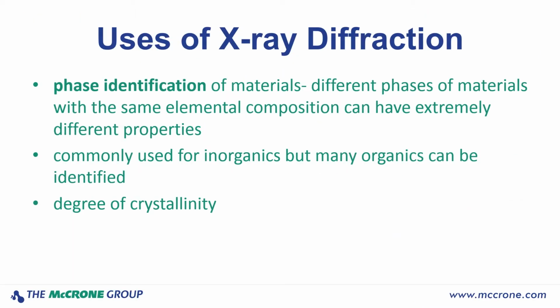Phase identification of materials. Simply explained, different phases of materials with the same elemental composition can have extremely different properties. X-ray diffraction can distinguish between these different phases. It's commonly used for inorganics, but more and more is being used for organics, in particular with pharmaceuticals. You can also distinguish the degree or if something is crystalline or amorphous using X-ray diffraction.